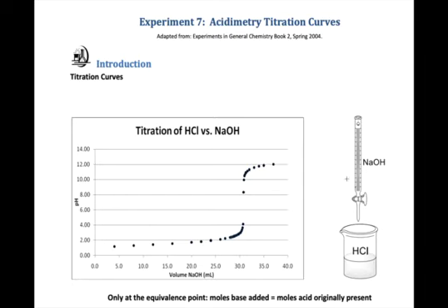Titration is quite flexible. We could have a well-known amount of HCl in the beaker with both volume and concentration, and a less precisely known titrant, and we can again find an endpoint and deduce something about the titrant. So there's a lot of flexibility in how we arrange what's in the beaker and what's in the burette. And for our particular example, we're going to be using a strong base in the burette and some kind of an acid that we're titrating in the beaker.